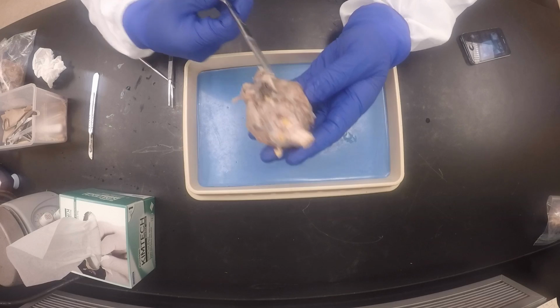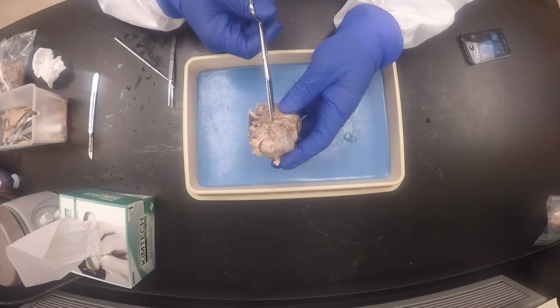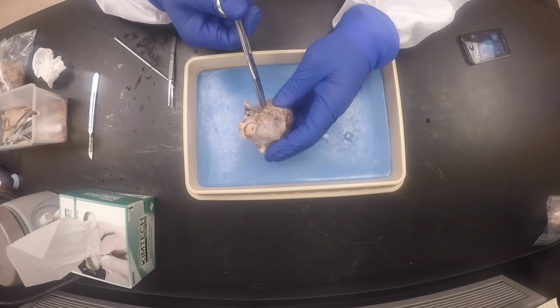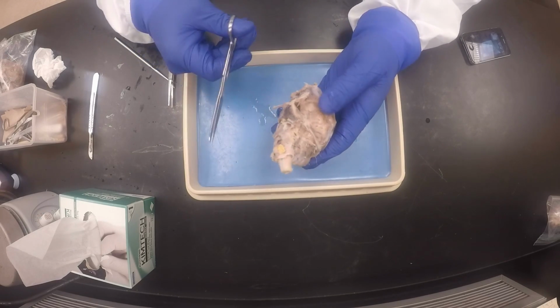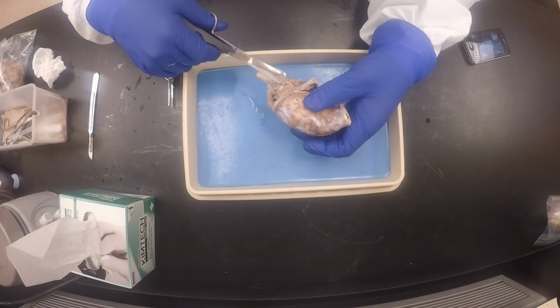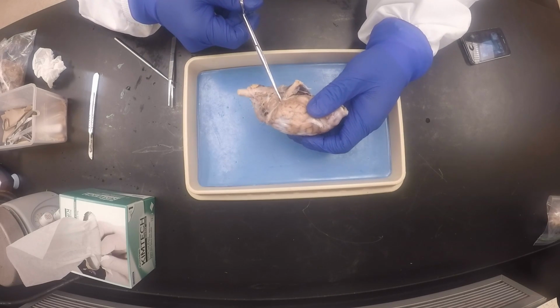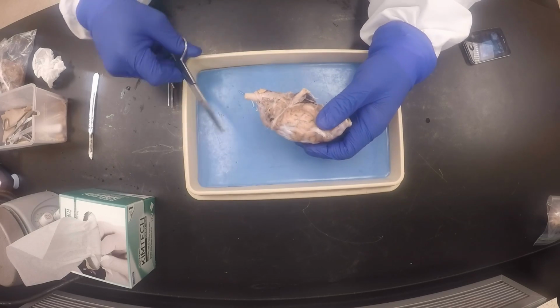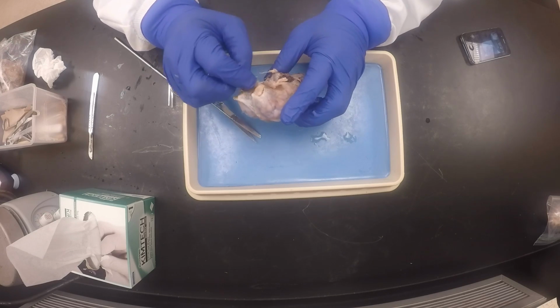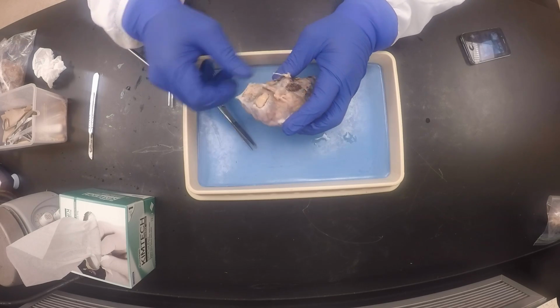So there you go. Once you get here, I go back to my sharp end because this is going to be really tough, okay? And then I do that. Okay, sorry, it dropped. And then I come and cut over here too. And then it should really be not so bad when you peel it off, as long as you make sure you cut through everywhere.